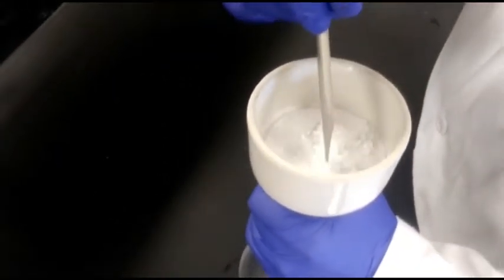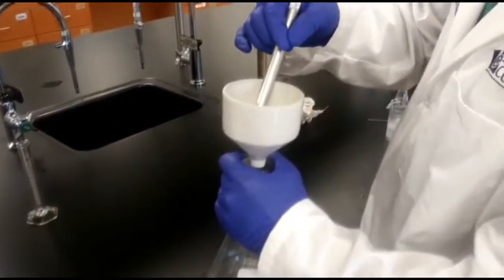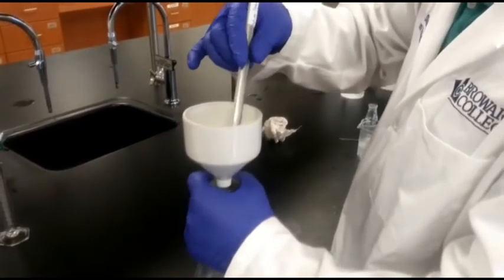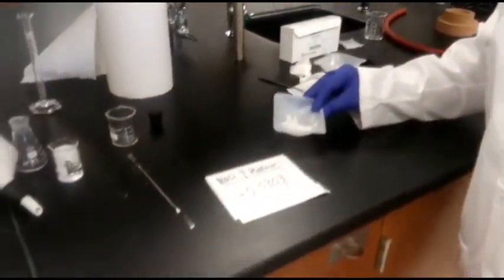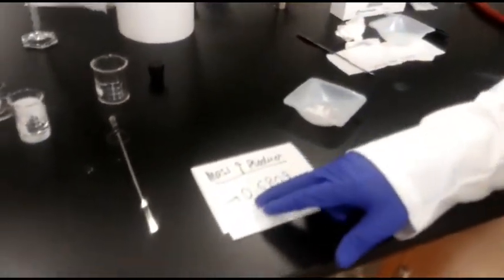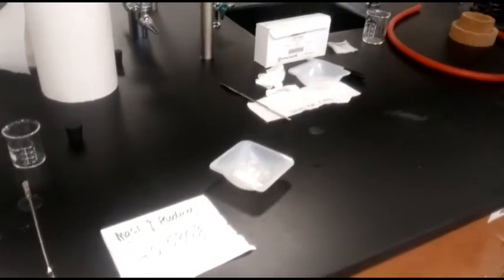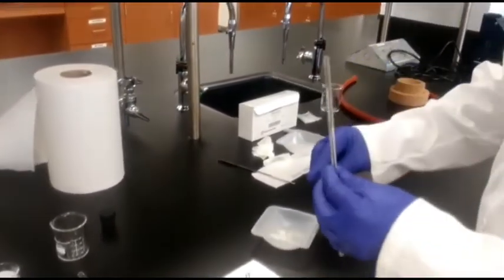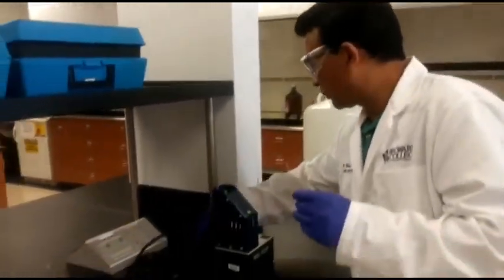Now we will find the mass of the product, and we also will determine the melting point and the IR and NMR of this product. Okay. Here we have got the mass of the product is 0.580 gram. Now we need to determine the melting point of this. So we use this capillary tube to load this substance there. So the capillary tube is loaded with the sample. Now we determine the melting point here.